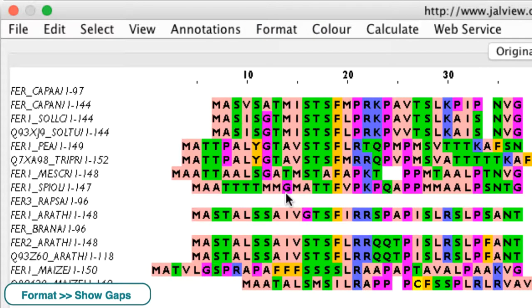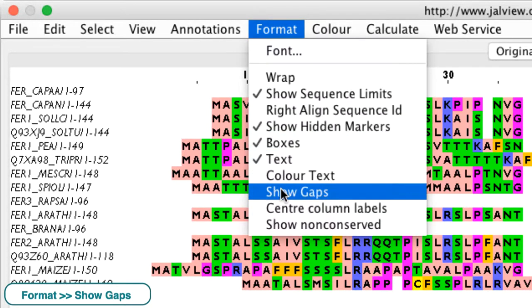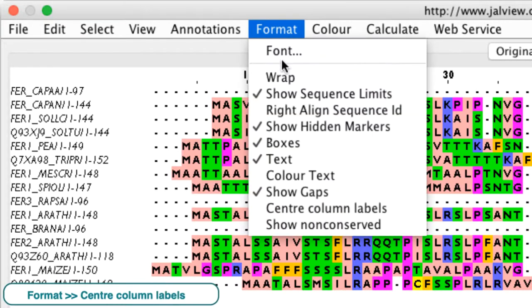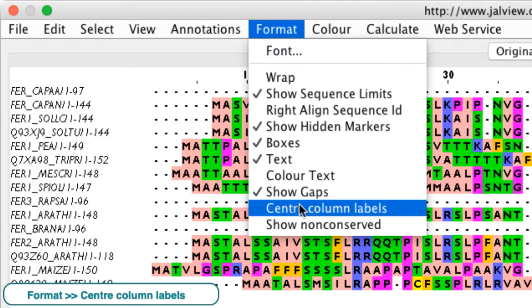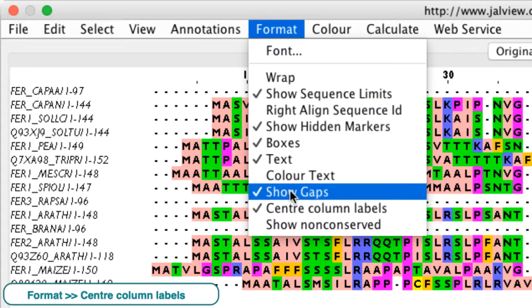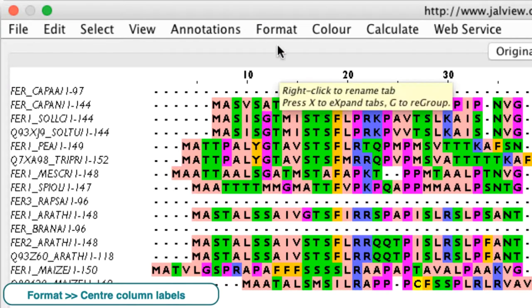Show gaps toggles the gap in the alignments as either blank spaces or characters. Center column labels change the alignment of the labels in the annotation row relative to the associated column.